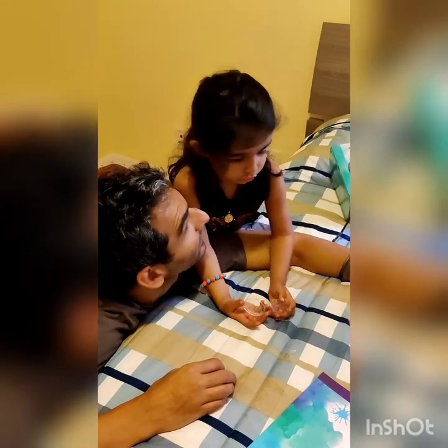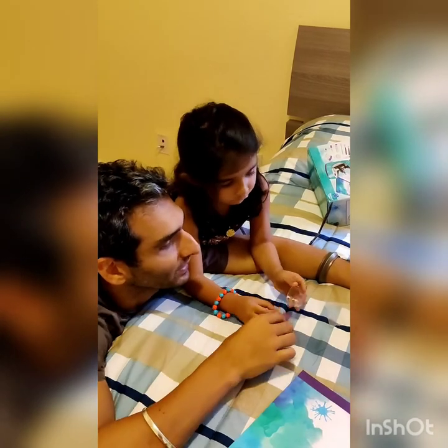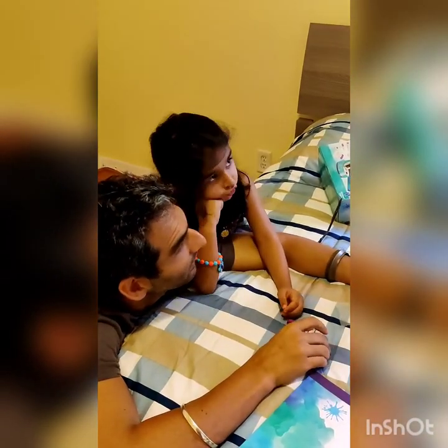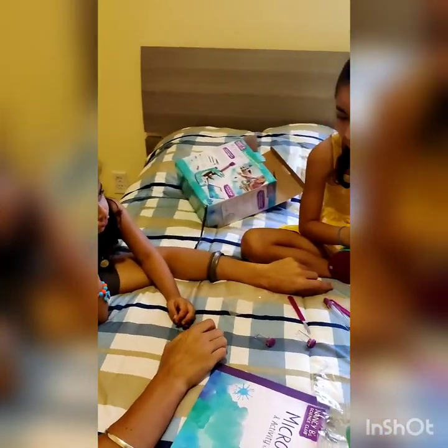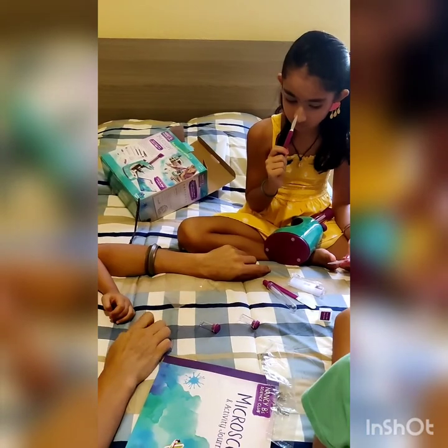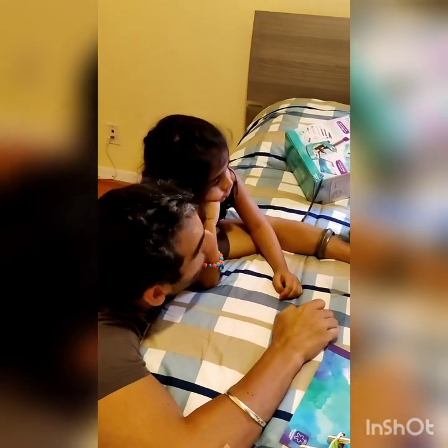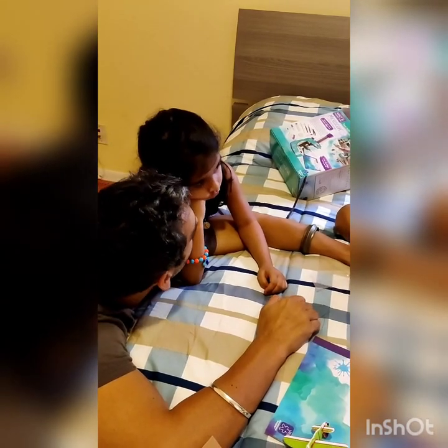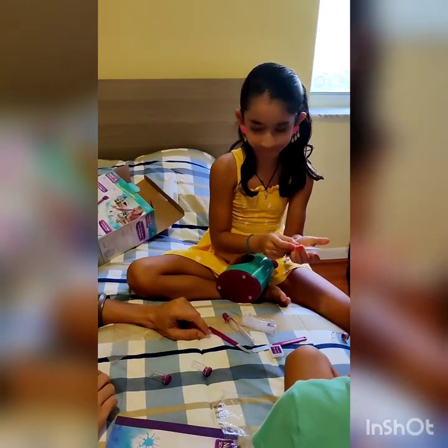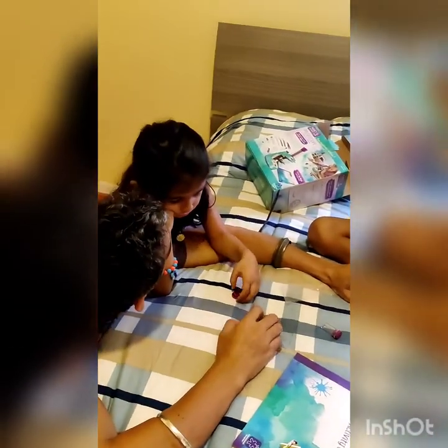You keep specimens. There's a peacock feather. You know what is a specimen? Where is the battery? Stoma. Ask Lisa. Lisa, she's asking you, what is a specimen? No. That's a scalpel. A specimen is like when I told you, like an onion or whatever, a small piece of whatever you're going to look at. Look, this is stoma. Say, specimen. They've given us some specimen.